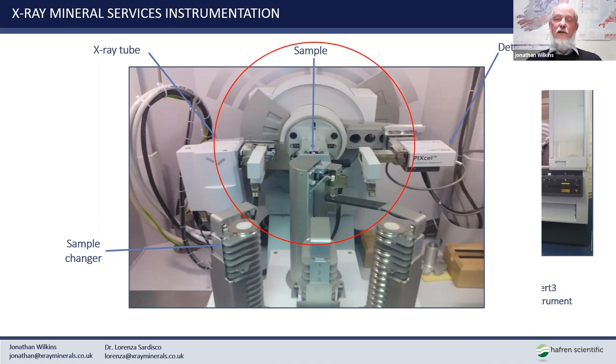And the angle, the horizontal angle that is made between the rest position that you can see now and the measurement position as it steps forward and upwards, is this magical angle theta, which appears in the Bragg equation, which we started off at the beginning. Now, the point about this is that by illuminating all possible diffraction angles, we will learn about all of the layer spacings for the materials which are being examined.